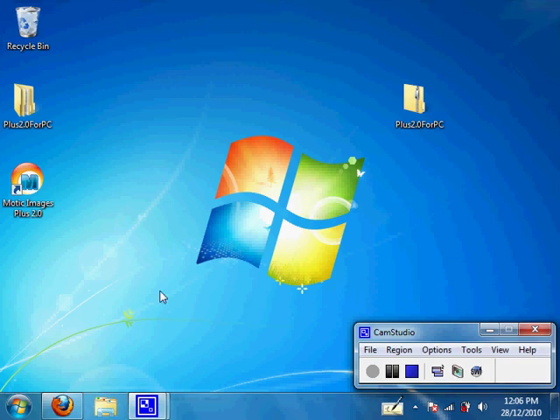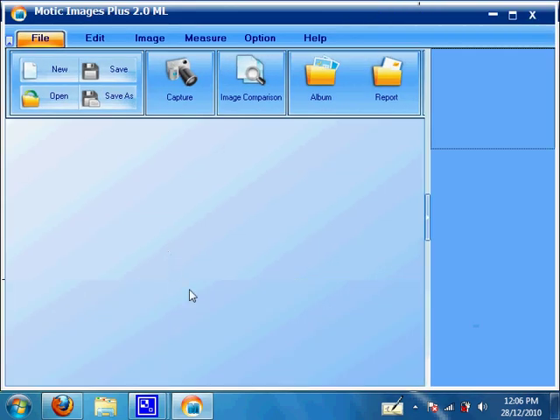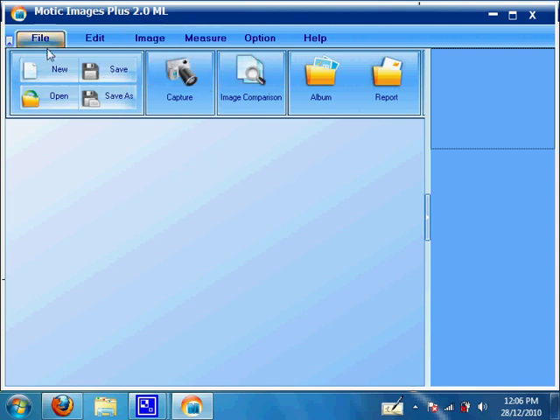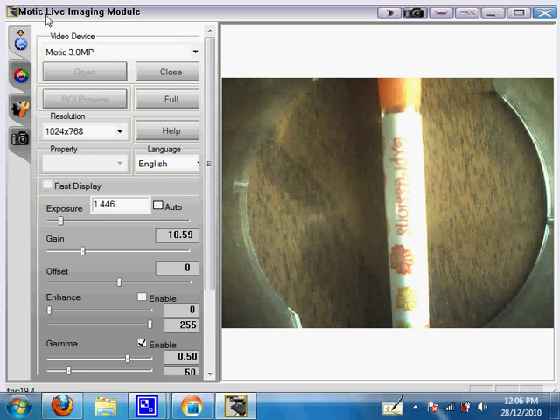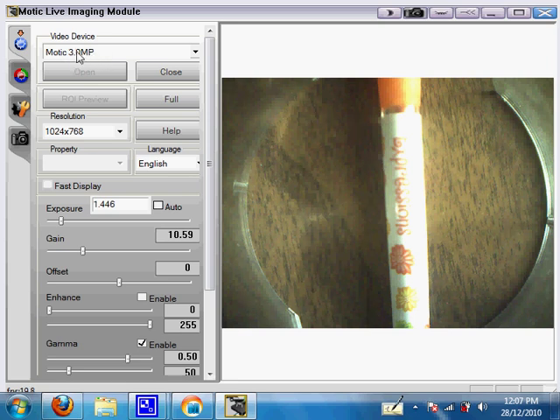Close down that window, then open Motic Images Plus 2.0 — it should be on your desktop. Once you open the main window, you may get a blue background or a grey background depending on the version installed. Go to File and then Capture (blue background) or File and then Capture Window (grey background) — both lead to the same next window, which is the Motic Live Imaging Module. You know your camera is connected when, under Video Devices, it shows your camera model, such as Motic 3.0 MP.